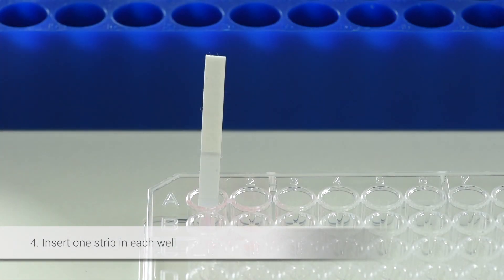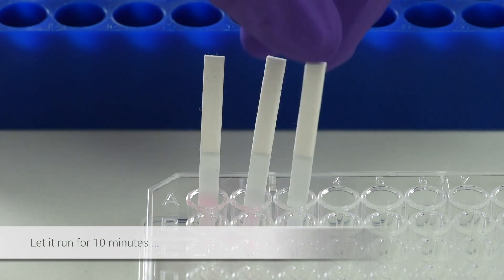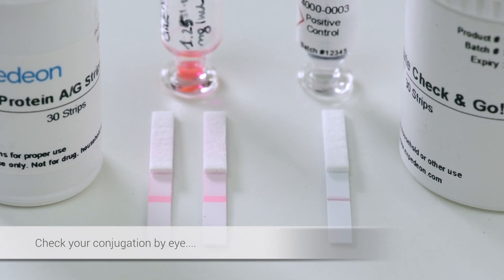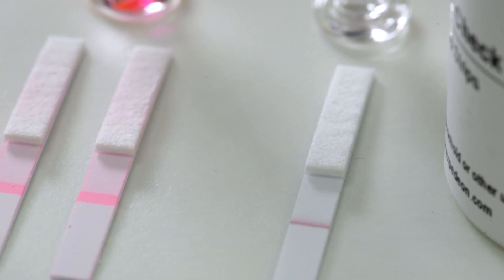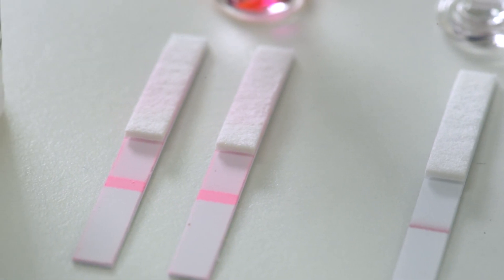Insert one strip into each well and let it run for 10 minutes. Check your conjugation by eye. The successfully conjugated antibodies flow along the nitrocellulose strip, binding to protein A and protein G that are concentrated at the test line to produce a visible line.